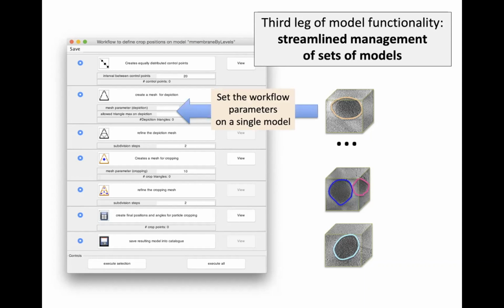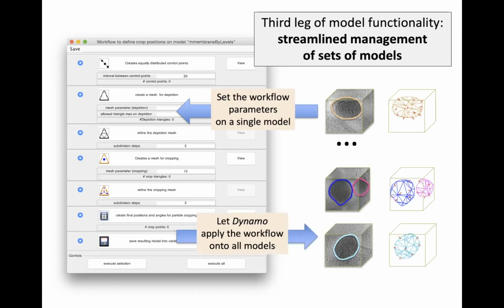So the idea is that you take one or two membranes of interest, you struggle with them a little, you make your battle so that, yeah, these parameters kind of work, so that you are satisfied with the distribution of particles that you get for one surface, and then you launch this extraction workflow to all the other vesicles in your data set, to all the other membranes of interest.